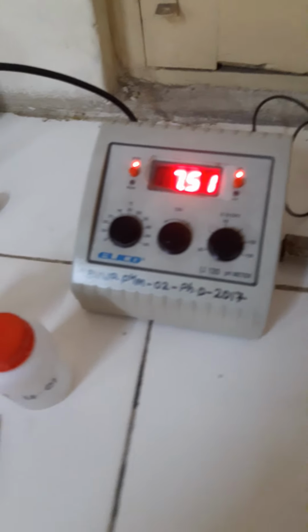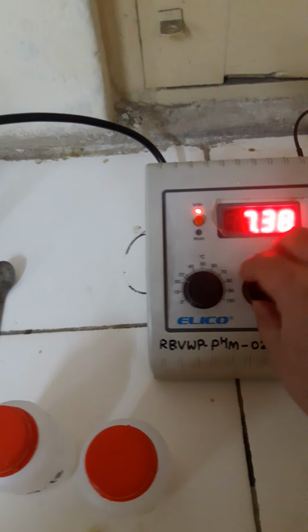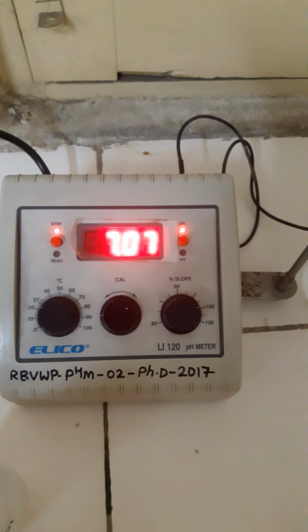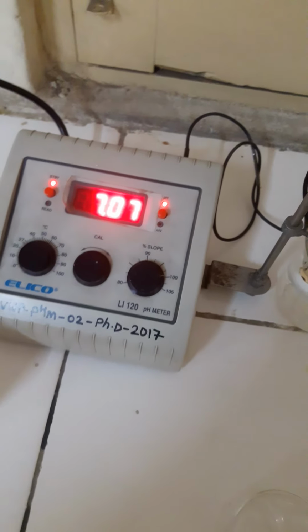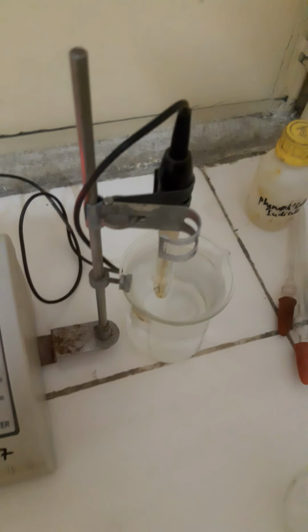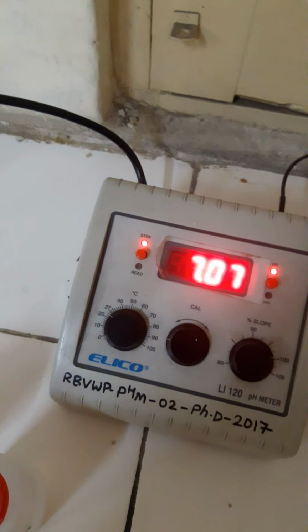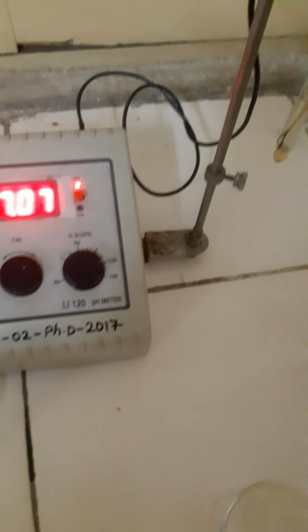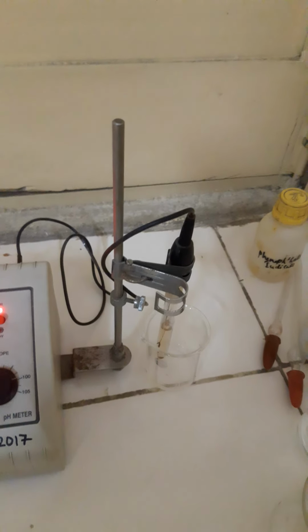This is the already standardized pH meter. It shows the pH of the water as 7.07, that is, first we have to adjust with the standard buffers, next we have to adjust with the water solution. The pH of distilled water we got as 7.05. Now we have to take 75 ml of the solution. So this is the glycine solution of 75 ml, right.